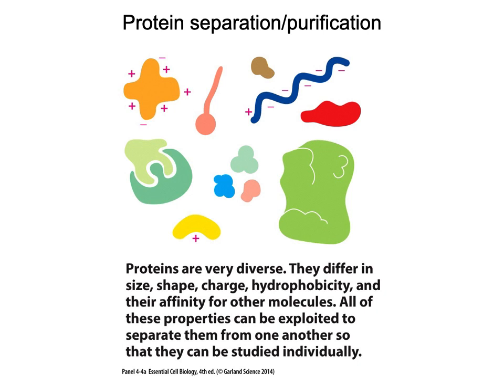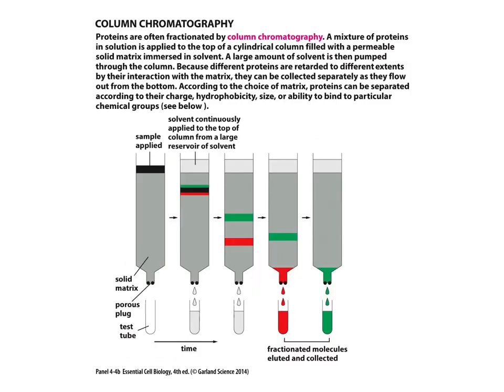So even if we pellet the different organelles, so maybe we have a pellet that has ribosomes in it, then a pellet that has mitochondria, and then a whole cell, we still need to be able to see those proteins, or maybe separate those proteins to see what other proteins they're interacting with. But we can take advantage of those characteristics.